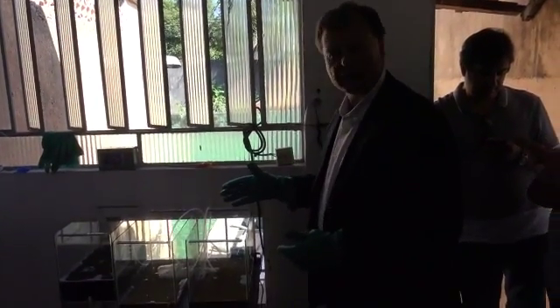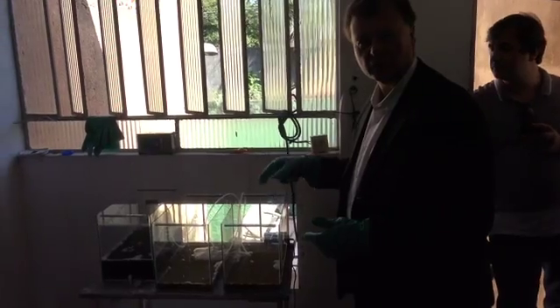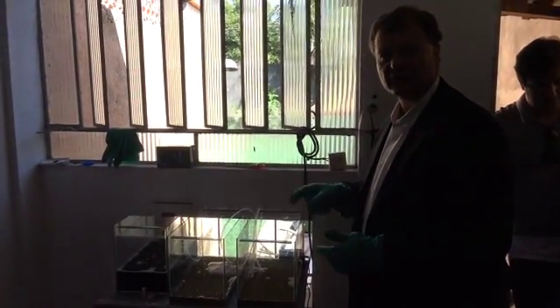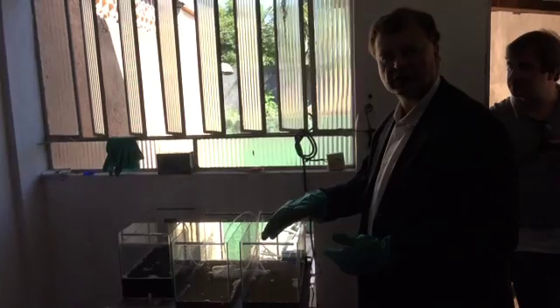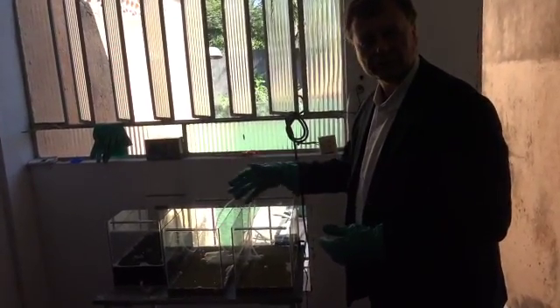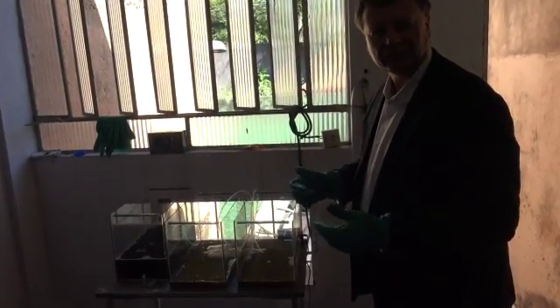We're going to take samples, as I stated, at 0 days, which is today, before we applied OSE II, 1 day tomorrow, 7 days later, 14 days later, 21 and 30, and we'll develop a degradation curve to show how fast OSE II will remediate the contaminant in the water and the sediments and remove it from the RIO Bay so there is no more contamination.